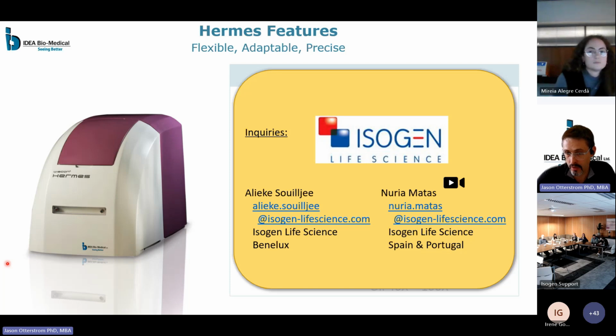I will mention it is a wide field microscope, so it depends on the question that you want. But certainly, in order to get a good characterization of the morphology of a spheroid overall, the Z range that we are able to achieve is useful for the ULA plates, where there's a bit of variability in the best focus plane. So we haven't had any trouble in terms of the Z range that we want to use. But again, it will depend on the sample type and the objective magnification that you want to use.